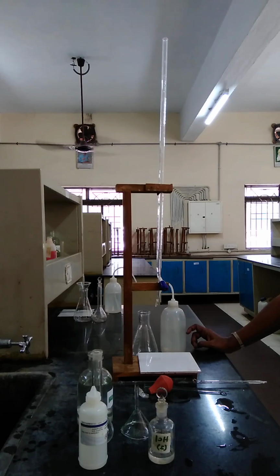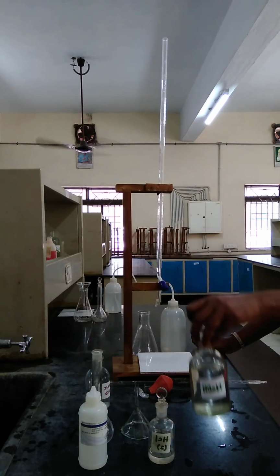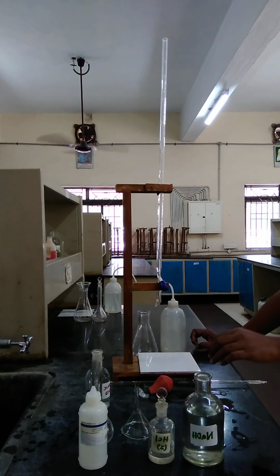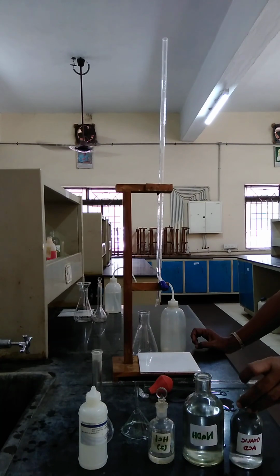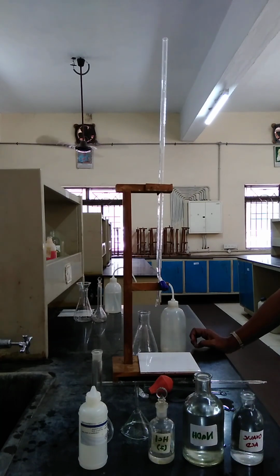Right? So for this one, the given sample is NaOH. Whatever the sodium hydroxide given, that is the burette solution. But the normality of the sodium hydroxide also they didn't give. So we are supposed to find out the normality of the NaOH first. We can call it the standardization of sodium hydroxide, or the standardization of the burette solution first. That's why in the first titration we are going to do the NaOH versus oxalic acid.